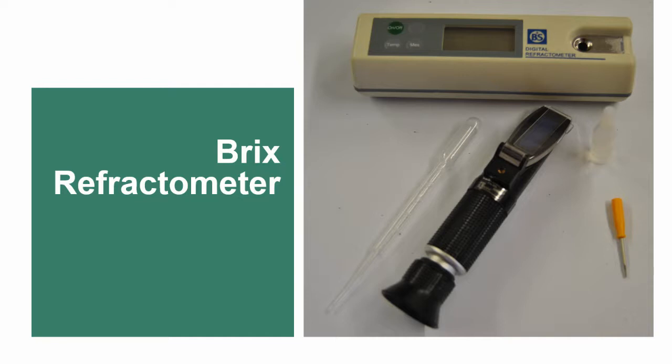Measuring IgG concentrations in colostrum can be very useful in managing colostrum quality and monitoring colostrum feeding practices. We can't tell by looking at colostrum how much IgG it contains, but we can use some simple on-farm tools to separate high-quality colostrum from low-quality colostrum and improve passive transfer rates.